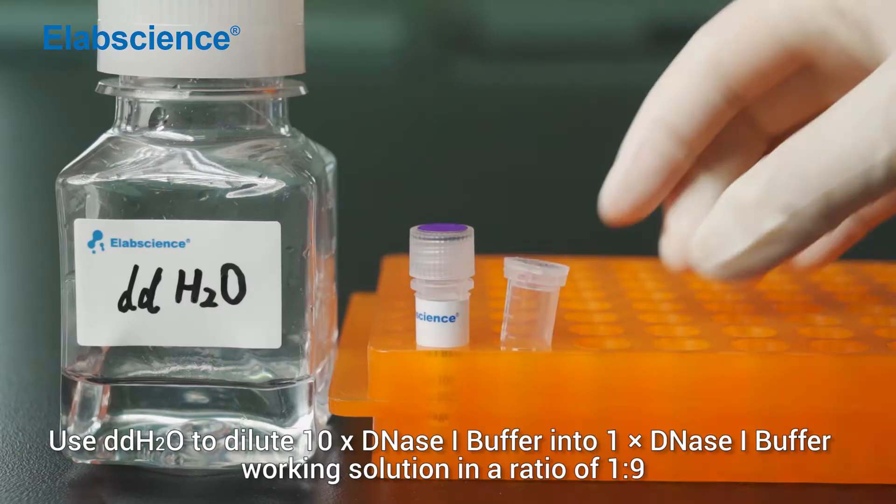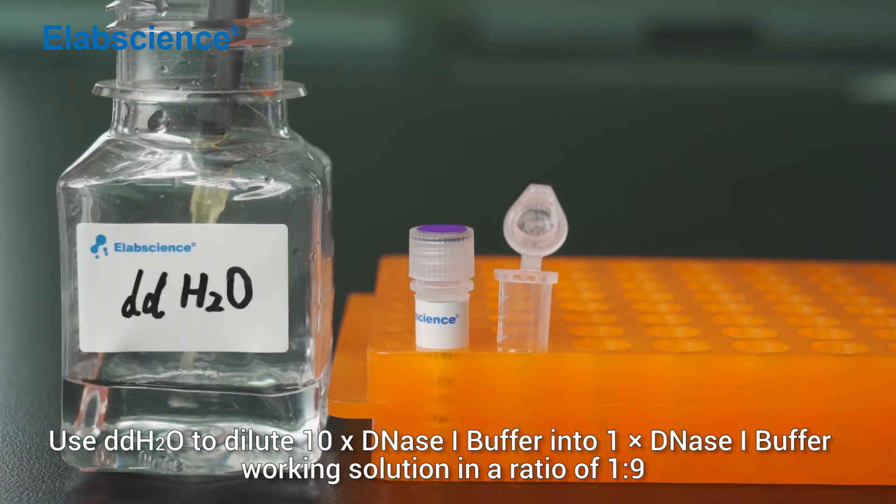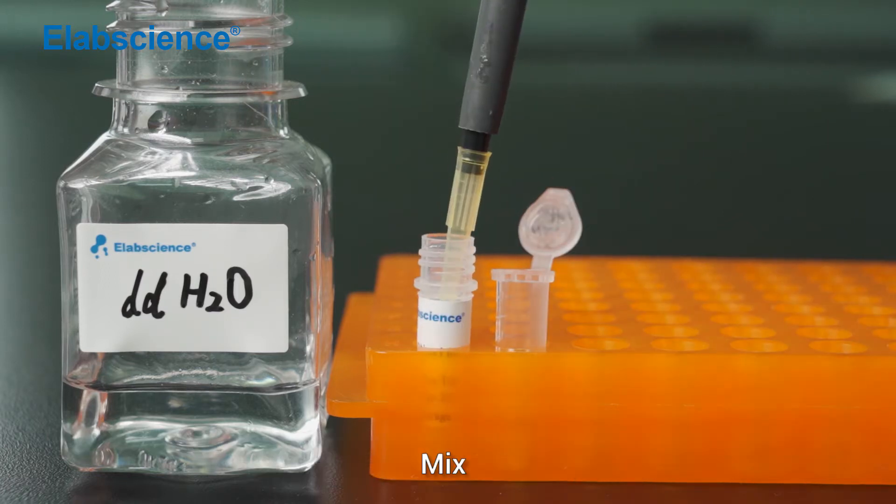Preparation of positive control. Use double-distilled water to dilute 10x DNS-1 buffer into 1x DNS-1 buffer working solution in the ratio of 1 to 9. Mix.